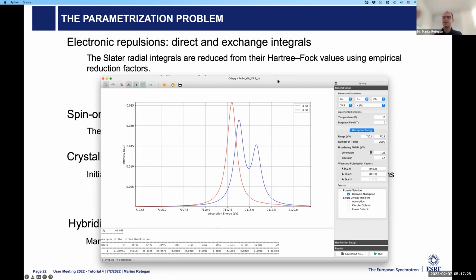As I tried to highlight in the case of data analysis using Jupyter notebooks, while it's more complex to do this in a notebook than in a user interface, there is great power in doing this in a notebook, because it's possible to do the analysis, for example, quicker for a larger number of samples. In the case of calculation, you can vary parameters more easily in order to find the best agreement with an experiment.